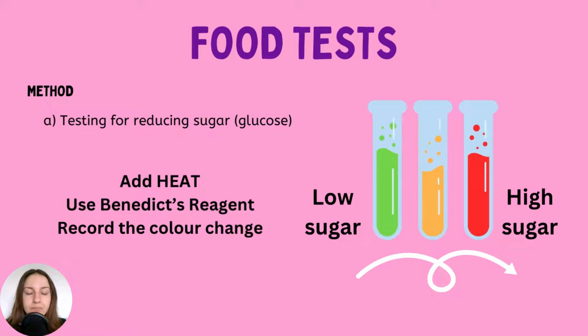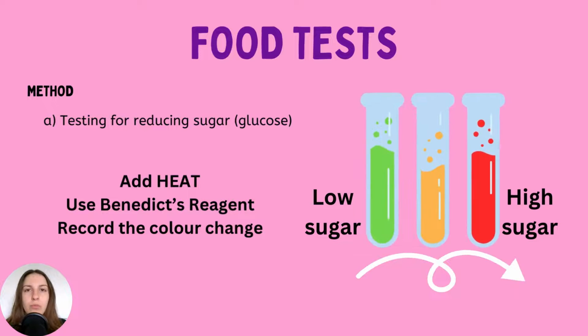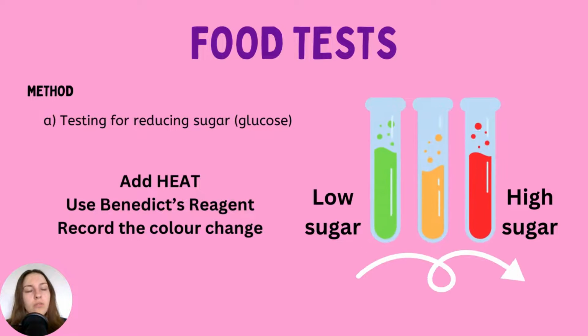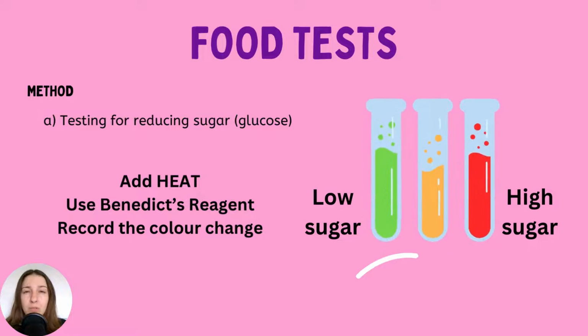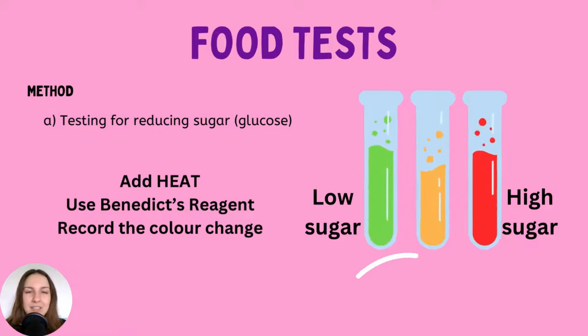What you should do, you want to label your boiling tubes. Okay, you want to make sure they're labeled with what is inside them so you know what it is. You also want to use a rack, of course, as well, if you can, to ensure that they're placed in the water bath. You probably want to use a metal one instead of a wooden one for obvious reasons, so that it doesn't get wet, or damaged, I should say.